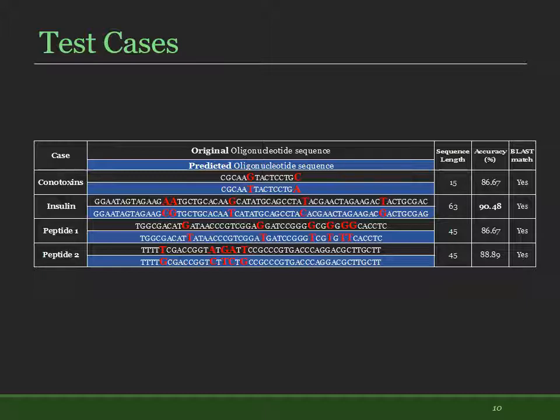Now there is only one question left. Is 88% accuracy on average good enough? Actually, the answer is yes. The next step after single base type prediction is application-specific post-processing. For instance, here we knew that the reconstructed sequence has biomedical use, so we fed the predictions to a publicly available tool called BLAST. And it gave us almost the same result as if it was using the original DNA sequence, which basically means that we were able to perfectly steal our target DNA sequence.